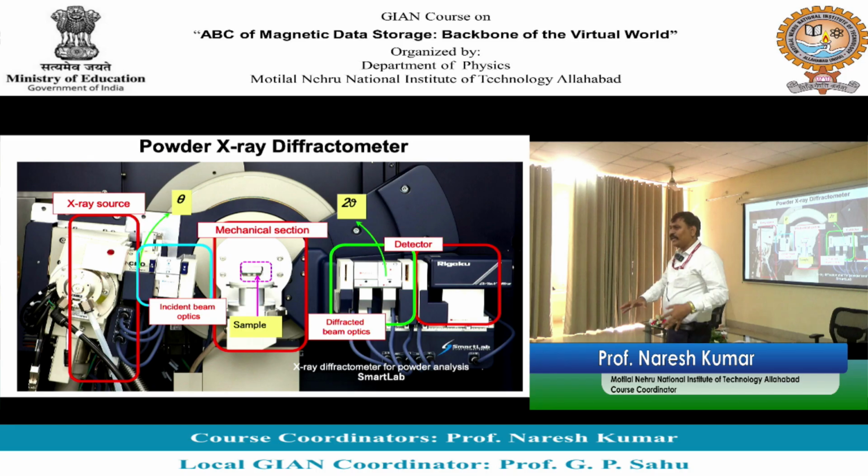10 अलग अलग टाइल्स लगाते हैं, एक कुछ और ओरिएंटेशन की, जहां d value कुछ है, दूसरी where d value is something else, third with different d value, fourth with some other d value. Now you have X-ray. So let's say for this plane, if my Bragg's condition is getting satisfied at 10 degree, so what will happen? At 10 degree I will get a peak.